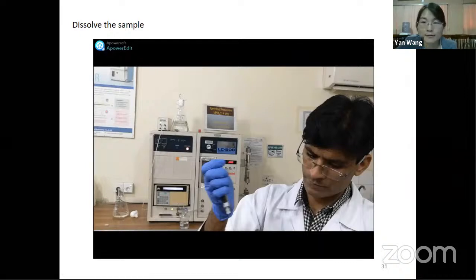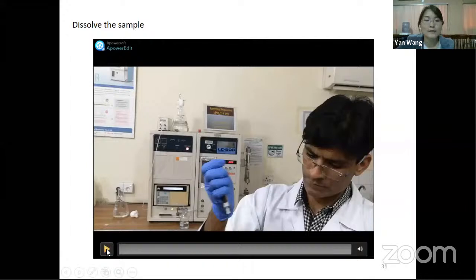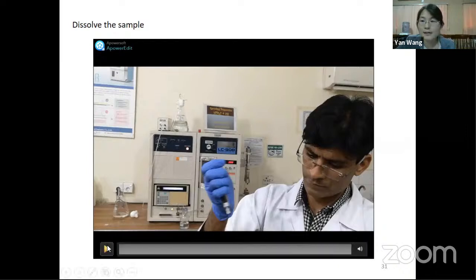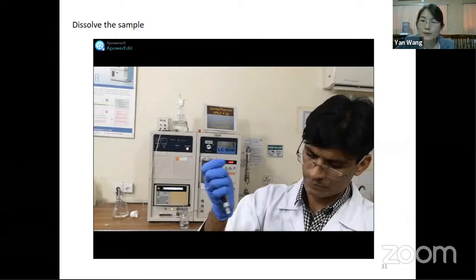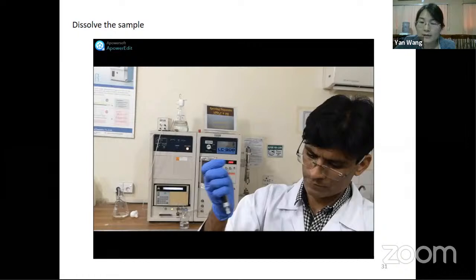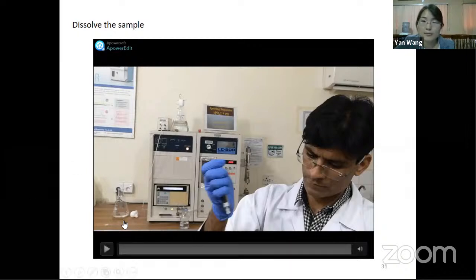One thing we have mentioned before is that we have to dissolve the sample properly in your mobile phase. This is to make sure we are not going to see a very different solvent peak. If you're using reverse phase, for example a methanol-water system like 50% methanol, and you dissolve your sample in methanol, what will happen? It's not a disaster, but you will observe a very big methanol peak.